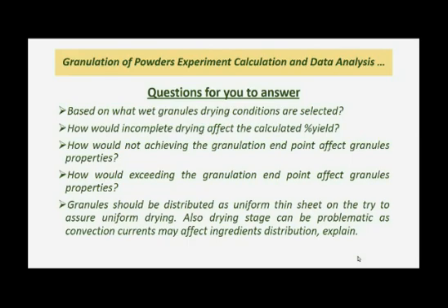Granules should be distributed as a uniform thin sheet on the tray to assure uniform drying. Also, the drying stage can be problematic as convection currents may affect the ingredients distribution. Please make sure to know this effect.